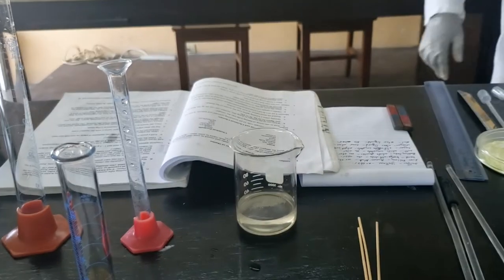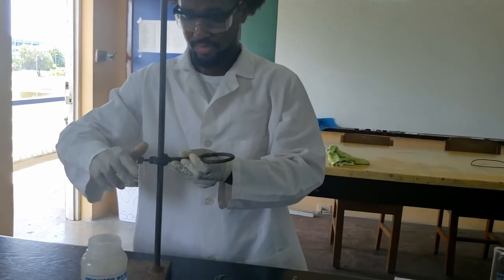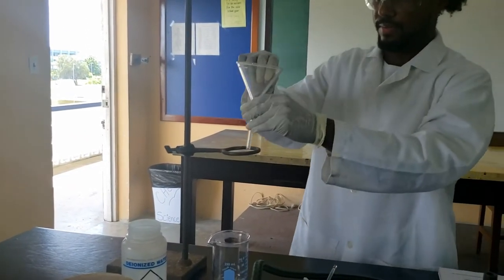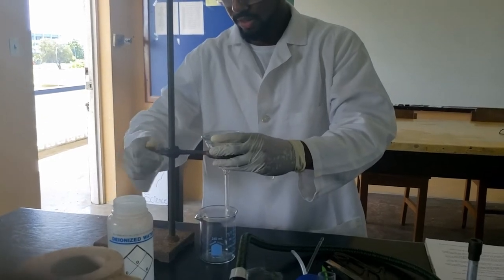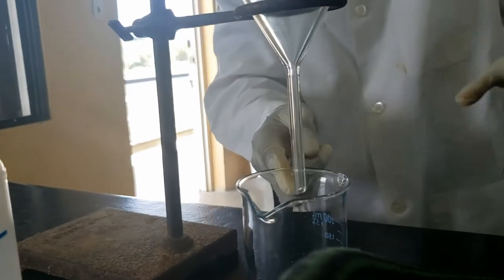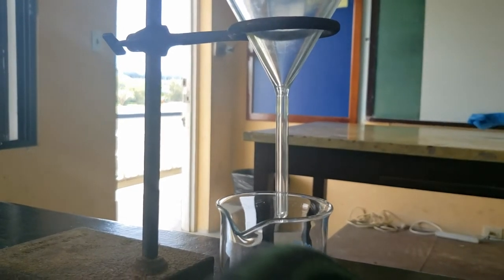Now we are going to prepare to filter that solution. We set up a retort stand with a ring clamp and a funnel. When we are filtering, we normally want the funnel to just sit inside and kiss the edge of the beaker or container. That angle helps it pull down the liquid through capillary action — that way you don't have any splash and it tends to form a steady stream.